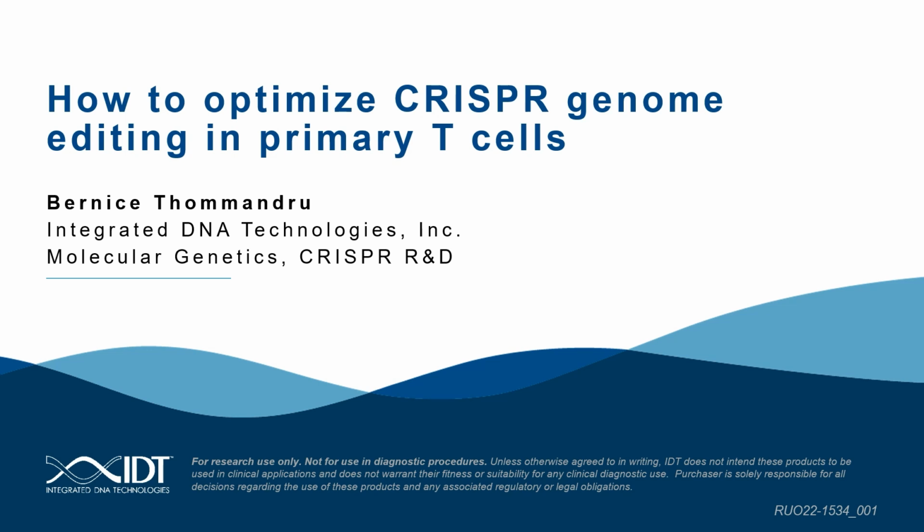I've been at IDT in the CRISPR R&D group for about 6.5 years, so quite a bit of time at IDT. In the last couple years, I've worked on this project optimizing CRISPR editing in primary T cells, and so today I'm going to talk to you about some of the optimization work and what led us to improve rates of editing in primary T cells.